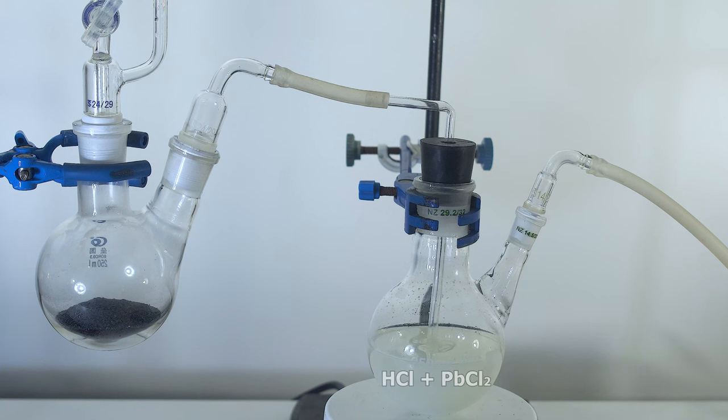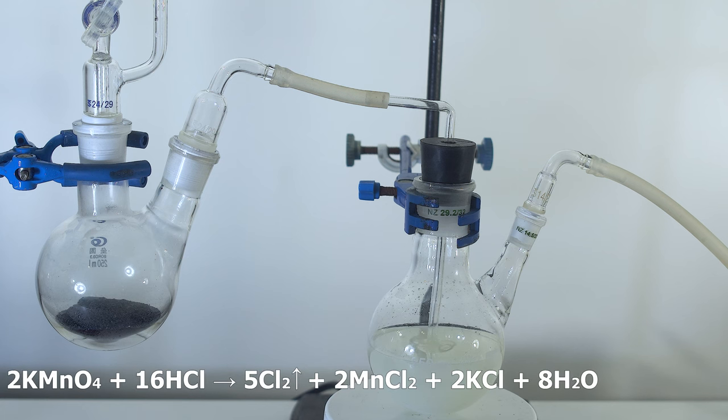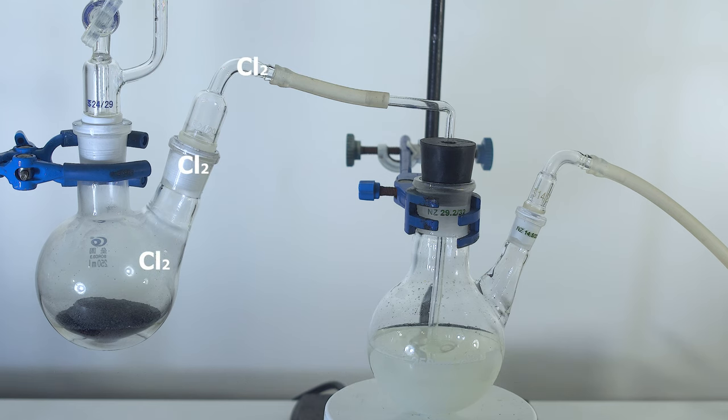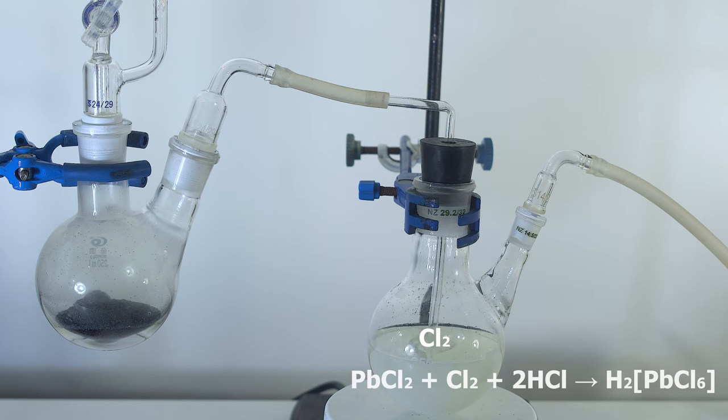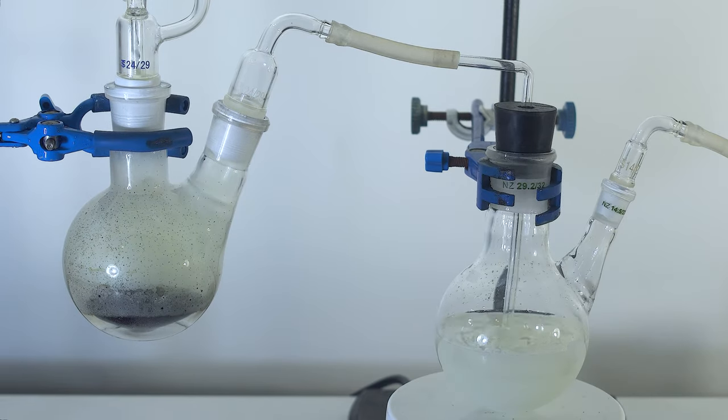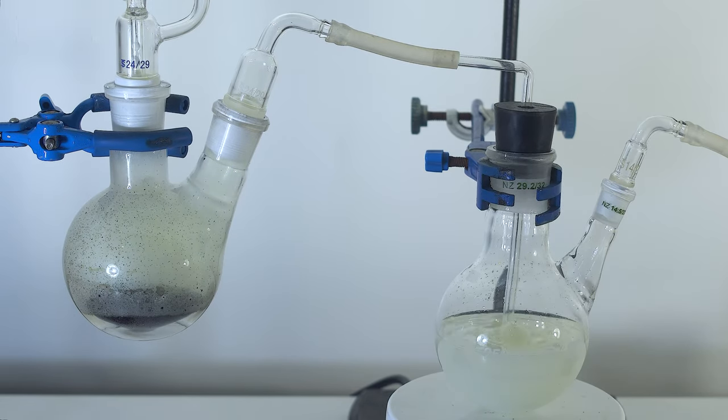So let's start our synthesis with adding hydrochloric acid to potassium permanganate. Chlorine that evolves as a result of the reaction flows into the flask with lead dichloride, where it oxidizes lead to oxidation stage plus 4, thus forming chloroplumbic acid. It's clearly seen by the color change of the contents of the flask.